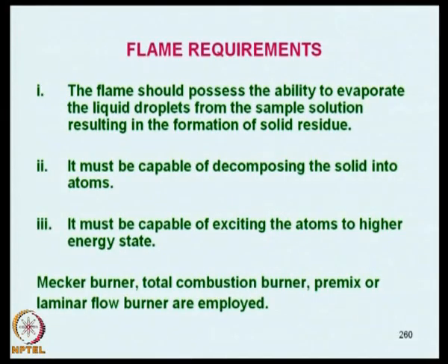And if we have this kind of arrangement, then we can take a look at the flame requirements. Now, what are the flame requirements? Very simple. The flame should possess the ability to evaporate the liquid droplets from the sample solution, resulting in the formation of the solid residue.